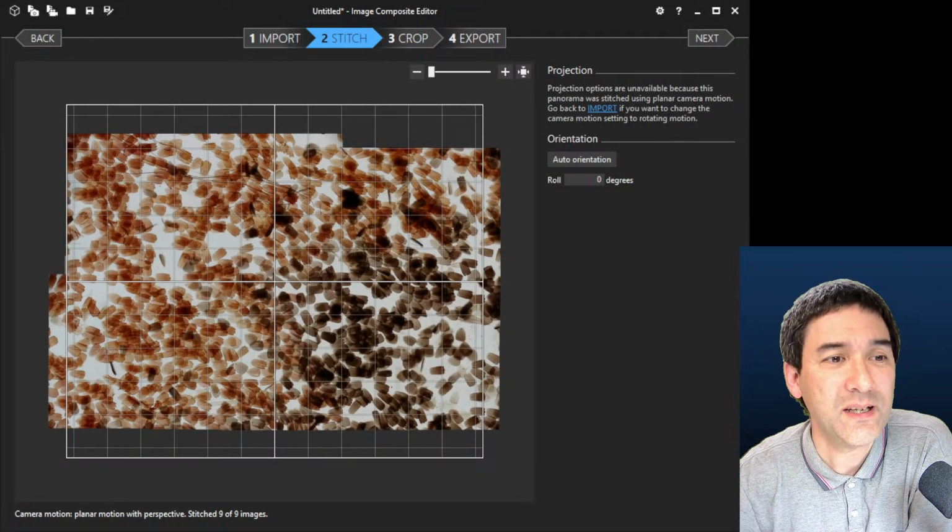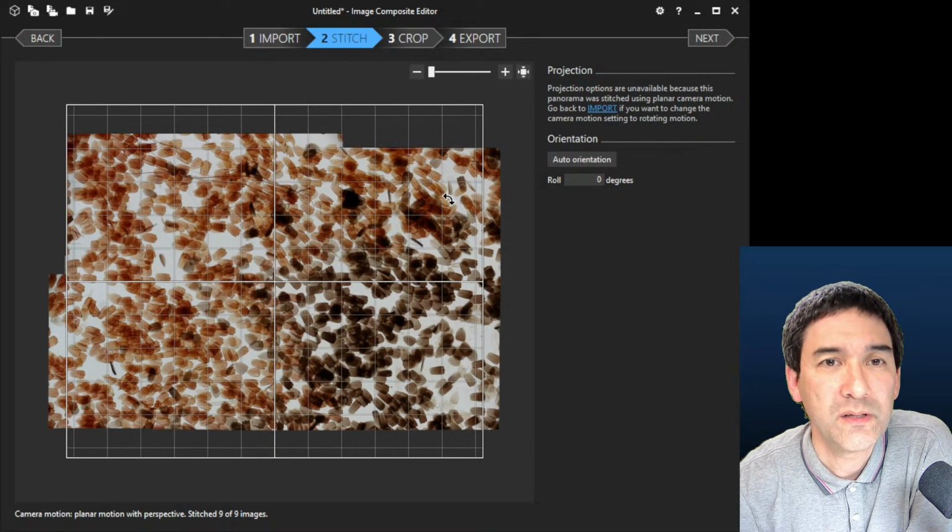So, and this already shows the following. That's the combined image, and what we see over here already is that it's not a square image, right? And that's fine. So I go crop.